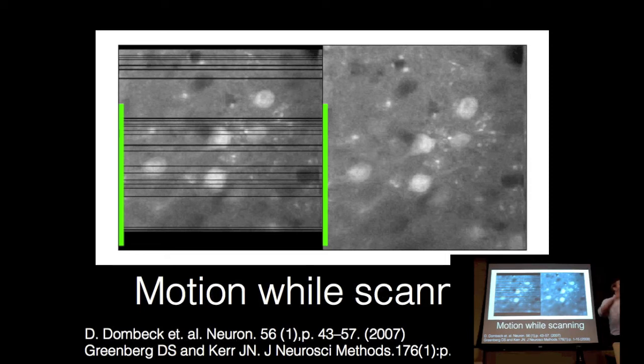But if you're not scanning in Z, then when you move in Z, rather than blank lines, you've got blank slices, which is much worse. So that might be a situation where you're going to try and tweak your experimental acquisition somehow to either get a smaller frame size or to improve the way in which you do the surgery.